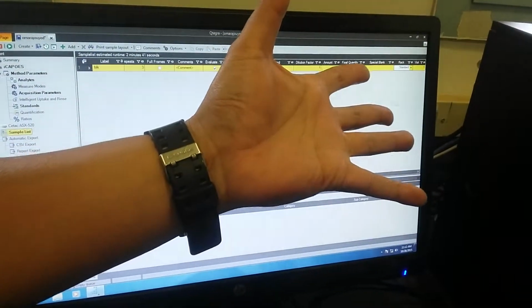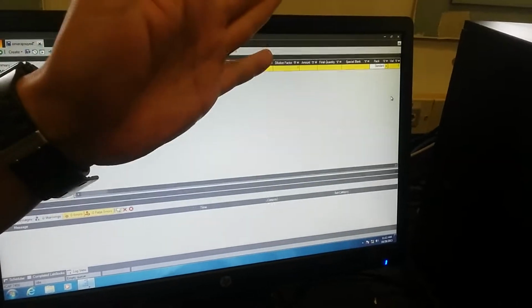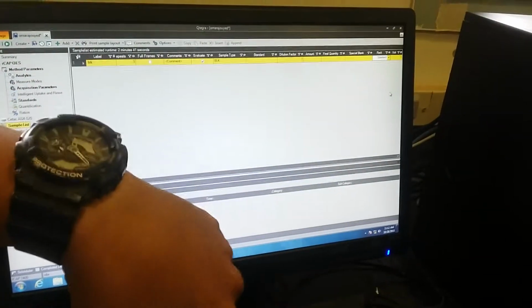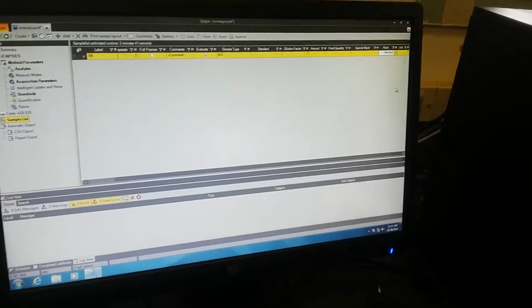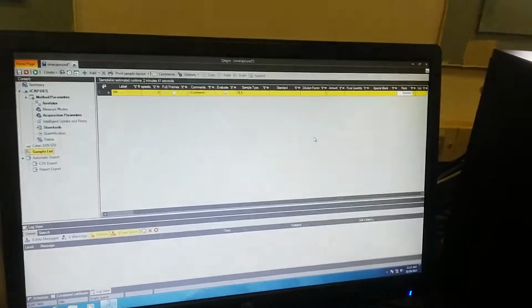I'm talking about the sample, not the standard. For the standard, usually dilution is 1, which means no dilution. But later in the sample, if you digest the sample and you have a dilution factor, then you put it there. I put the dilution factor so that he calculates automatically. I don't have to go back and do the calculations outside. You will get the final result.